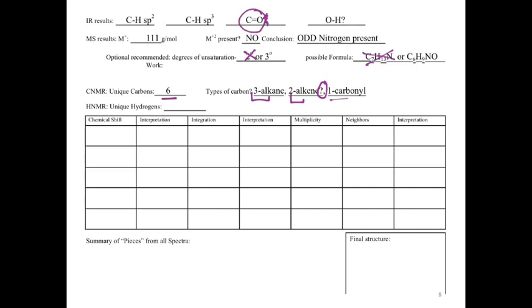We don't know anything necessarily about that OH, because it could still be there. If it was, we're going to have to do some funky, fancy footwork with our formula because we've only accounted for 1 oxygen. Okay? So, we're now progressing through this, not too bad.